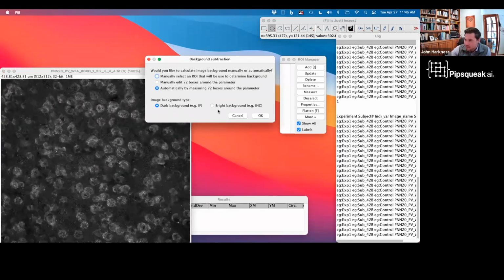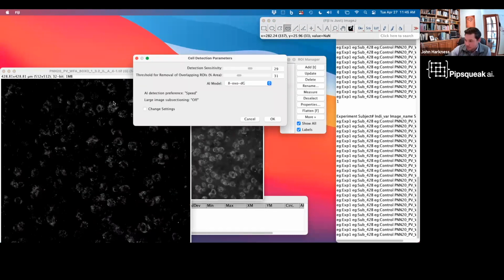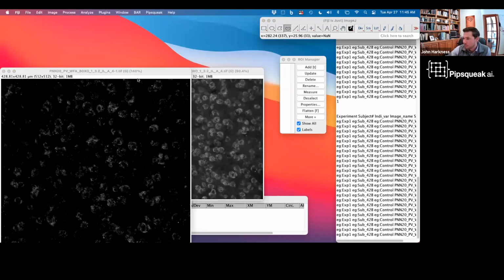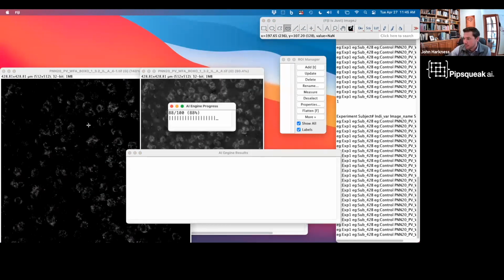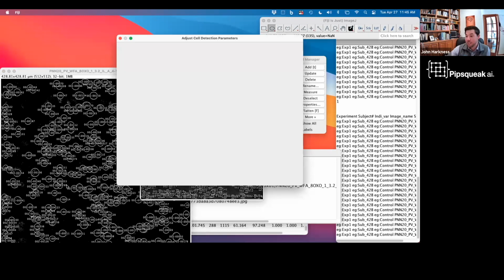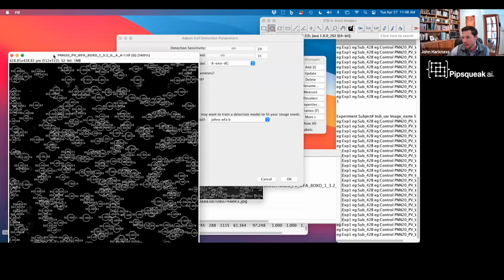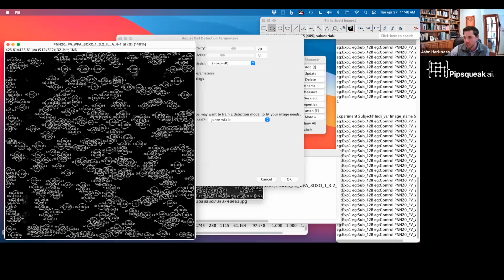And then lastly, here's my WFA. So we'll just go through that one really quick too. Or not WFA, this is my 8-oxo. So cool. These are always amazing to see pop up because there are just so many cells in it. It's always really encouraging just to see the work that I don't have to do. To give you an idea of the amount of annotation that went into just this model alone, I think we had nearly 1,000 images, each one of these with like 500 or so cells on it.